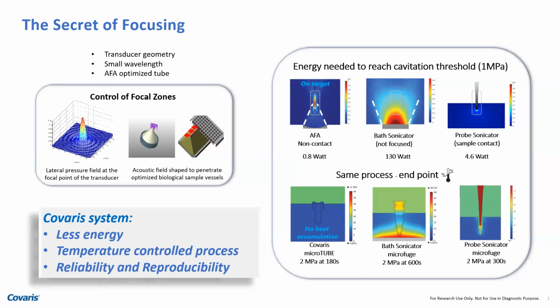Over a period of time, these bubbles collide, just what you would see in the shower. A lot of droplets eventually move and form a bigger bubble, and then it rolls down. So here they implode, generating some amount of energy, which is the shearing energy that is used for disrupting tissues, homogenizing cell lysates, working with whole blood cells, working with any kinds of tissues, so to speak, organoids, and so on and so forth, and then FFPE.